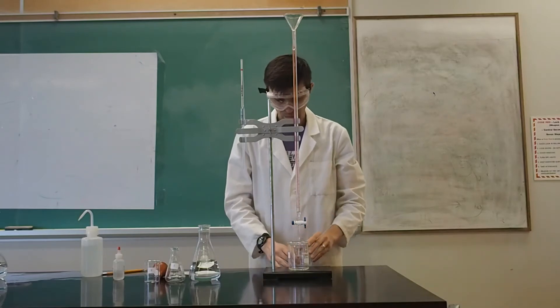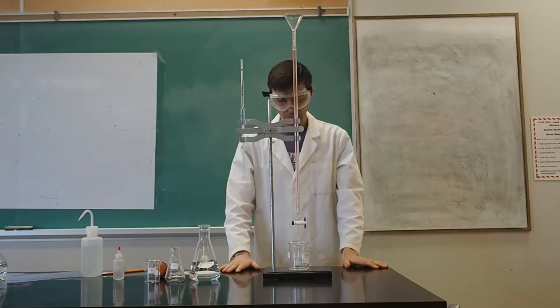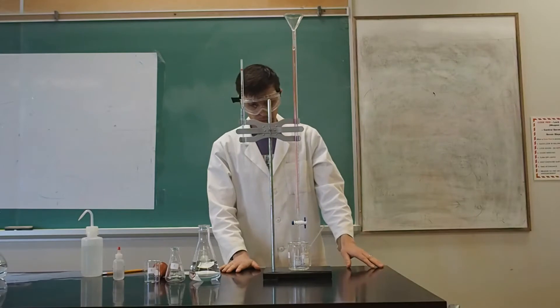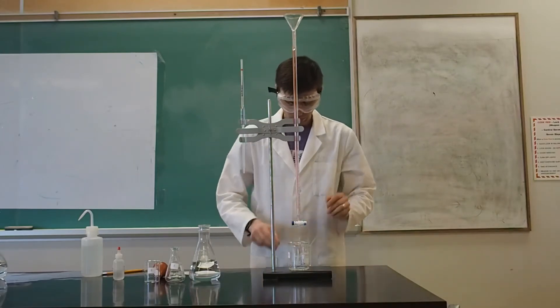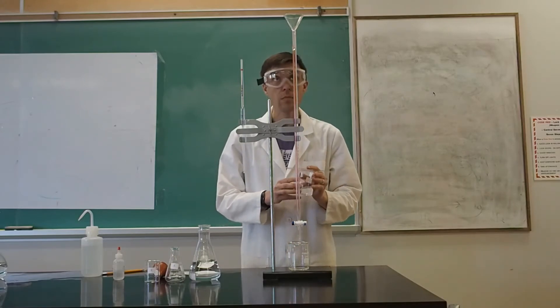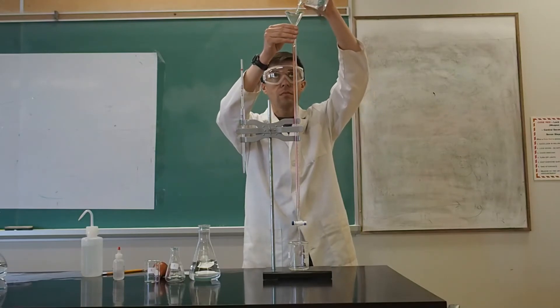Open the stopcock and let it flow into a waste beaker. There will always be a small amount of solution left in the burette tip. Never try to get that part out. Priming ensures that all of the solution in the glassware is the titrant, and is not diluted by the deionized water rinse.